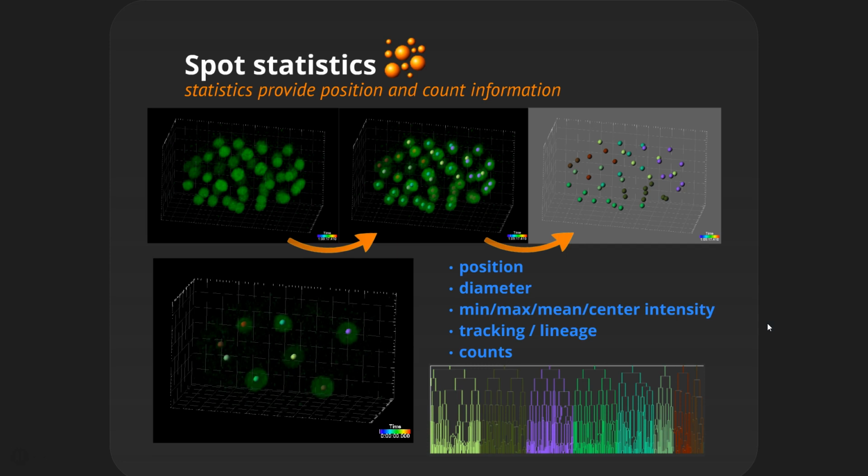The last thing I'm going to mention about spots is we also have a new tracking algorithm that is specifically designed for tracking cell division. This was introduced about 2 years ago now, but it allows you not only to track migrating cells, but if they divide, we now have the option for you to track that division, so you can track division rates and generation and all of that good stuff. That came out in 8.4-ish. So the BIDC currently has that tracking capability. I wanted to point that out.